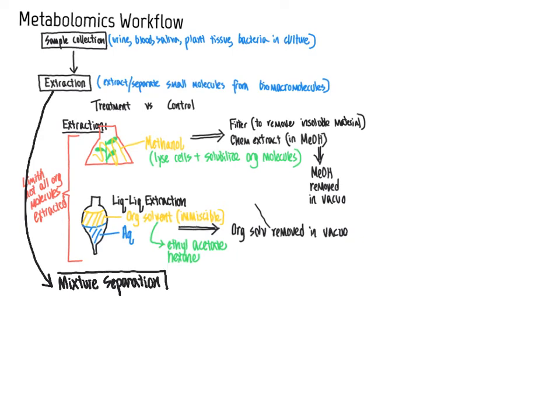And this is a step that is generally done in metabolomics, although I will say it is not always done. So we could consider this to some extent to be an optional step because there are some techniques available for NMR in particular that will enable the analysis of very complex NMR spectra that feature many different compounds. But as a general rule, the complex mixture is typically most commonly separated before it is evaluated by mass spectrometry or NMR in the metabolomics workflow.